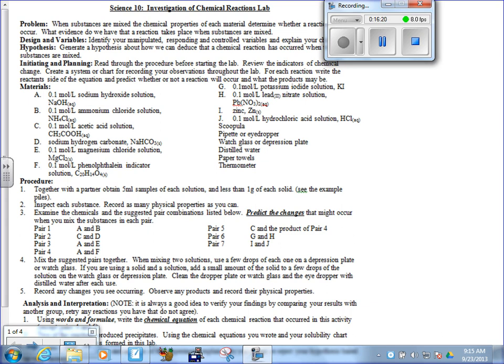It's actually kind of oily. So if you put it on there, you might see kind of like what canola oil or any other kind of oil does when it's against the side of a container. It kind of grabs it and slowly runs down. This might do that a little bit, which is why you don't want to use more than about 3 drops. As soon as you put it in the sodium hydroxide, you'll know, because it makes a very definite change. So just 3 drops will be lots for your purposes.